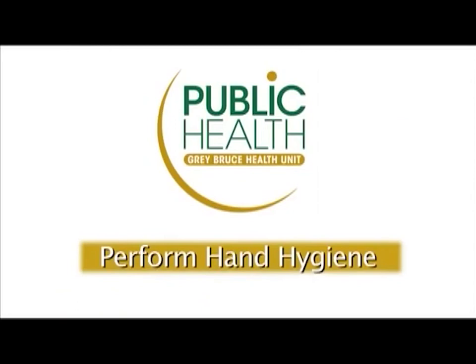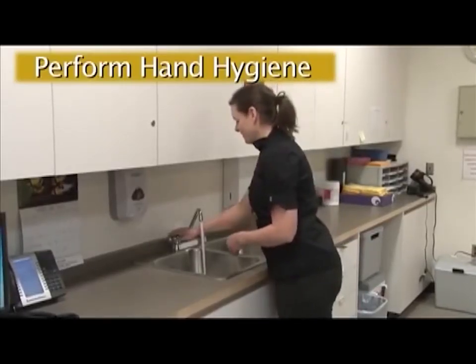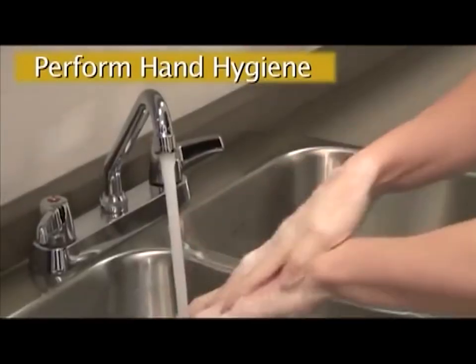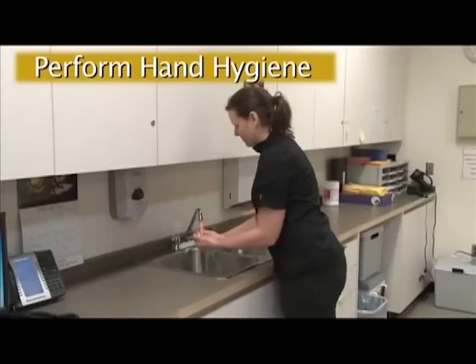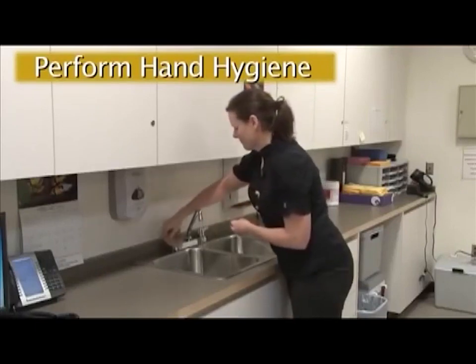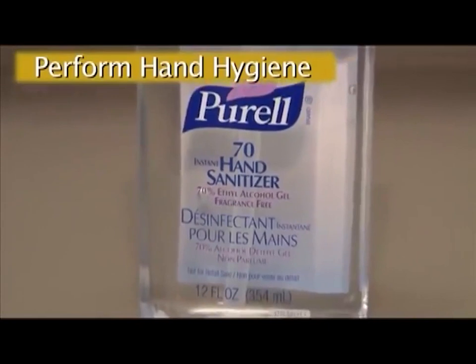Hand hygiene is considered the most important and effective infection prevention and control measure to prevent the spread of infections. Before donning your personal protective equipment, wash your hands. Step 1. Wet your hands with warm water. 2. Apply soap to produce lather. 3. Rub hands together for 10 to 20 seconds. 4. Rinse. 5. Dry your hands with a paper towel. And 6. Turn off the tap with a paper towel. If you're using an alcohol-based hand sanitizing product, ensure it contains an alcohol concentration of 70 to 90%.